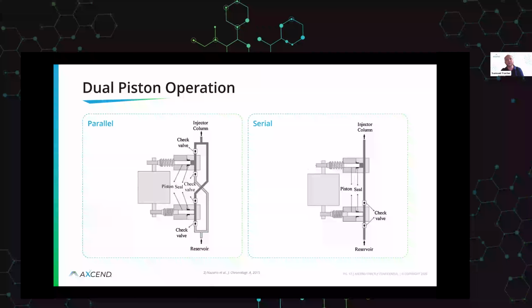These tend to be difficult in capillary scale because you often are trying to minimize the amount of dead volume or dwell volume that is used in the system. And so in unoptimized systems, I've seen pulse dampeners that have a milliliter of total solvent internally. And so if you were running at 1 microliter a minute, well, good luck ever seeing your gradient. We're talking now 1,000 minutes until you actually start to see any of that gradient shift. And so it requires special optimization when you're working on the capillary scale.